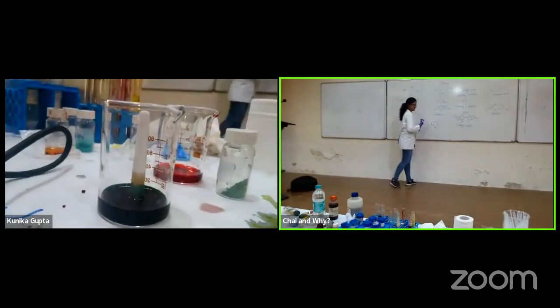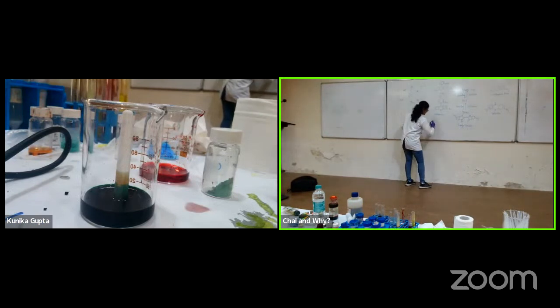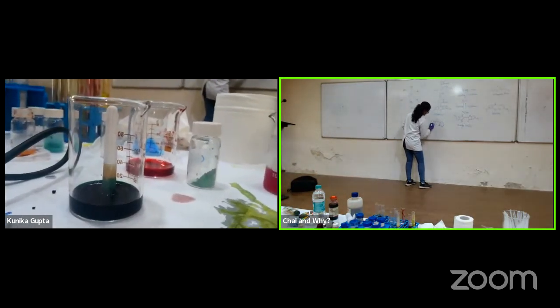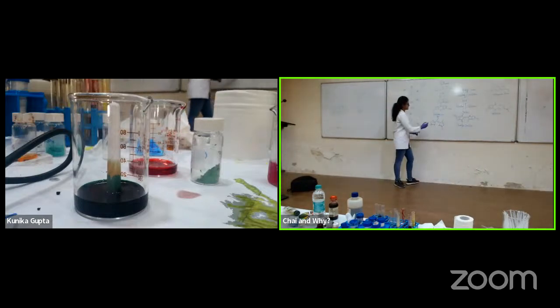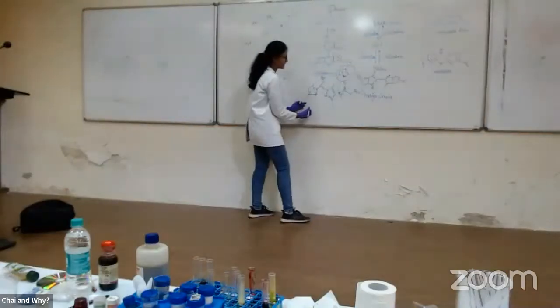It is this which I started with, and what I have got is this thing, which is in one liter, to which I added this. It was actually this phenol being added to this stuff, which ultimately gave me this.